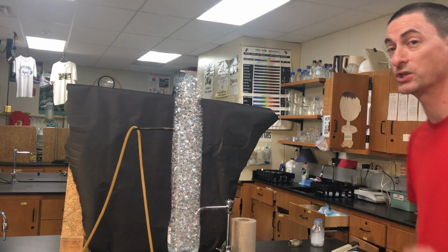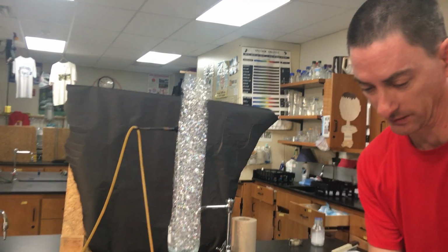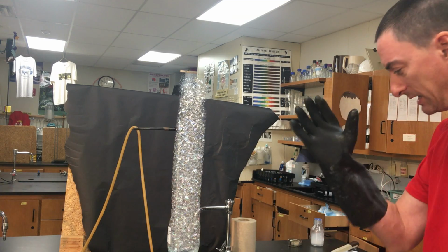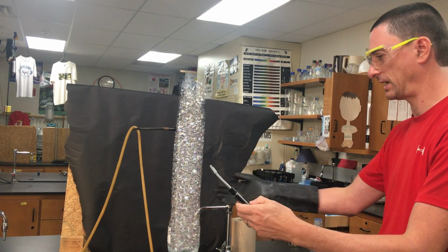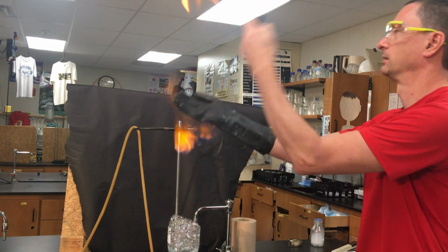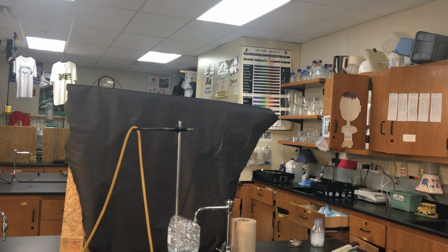But now I would like to show you one of the chemical properties of methane. And in order to do that, I'm going to need this glove. I'm going to put on some safety goggles. We're going to take this lighter. Methane gas is very flammable stuff.